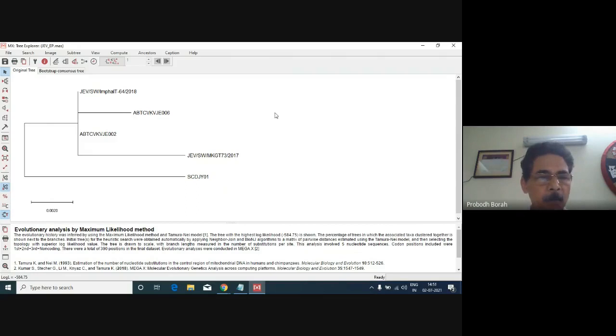And of course, here you must have very good internet connectivity. You must be online for doing it in this way. Otherwise, if you download the information and have a local file already generated, you can do this phylogenetic analysis completely offline also.